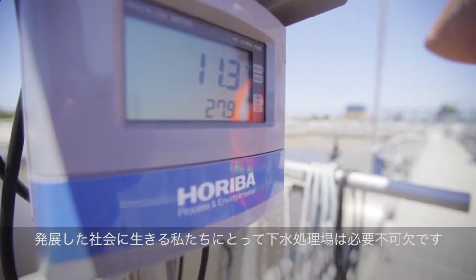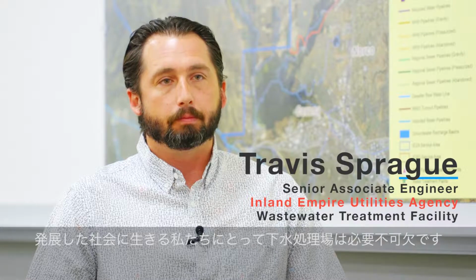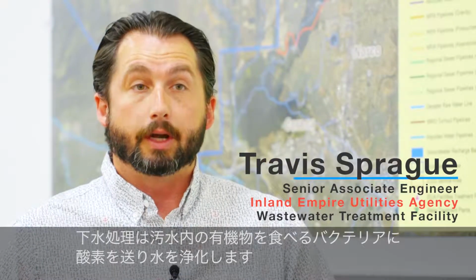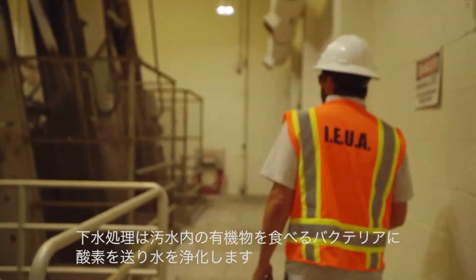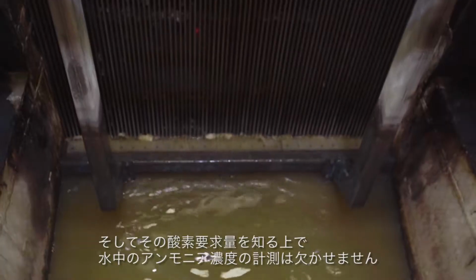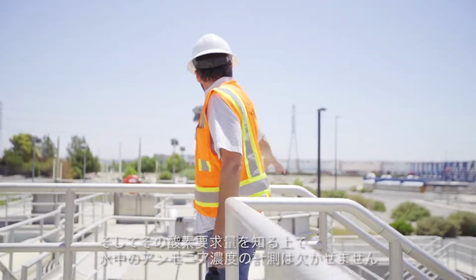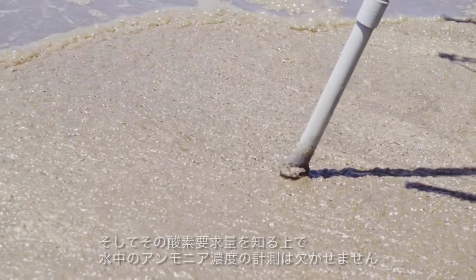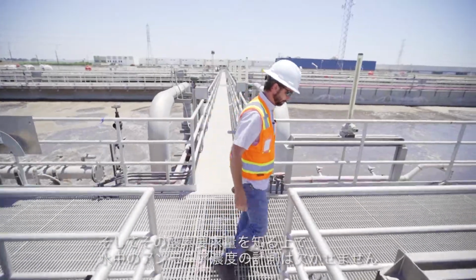As we advance in society, we couldn't exist without wastewater treatment plants. The goal of the ammonia probes is making sure that we completely nitrify to reduce that ammonia as much as possible. We limit our disinfection process of how much ammonia we have to add to the system, so it reduces our chemical demand.